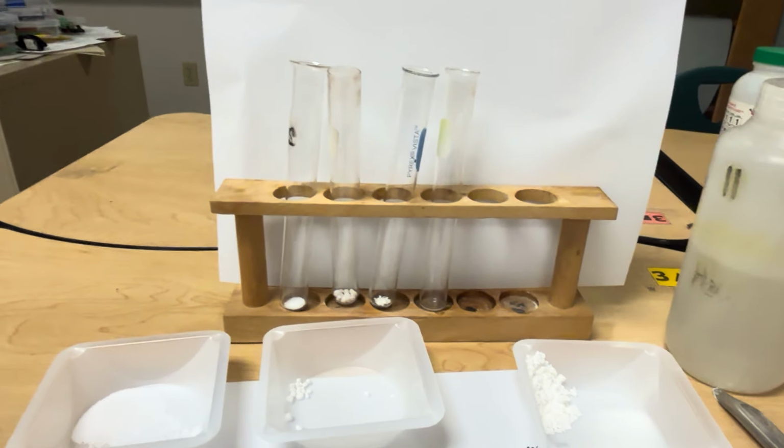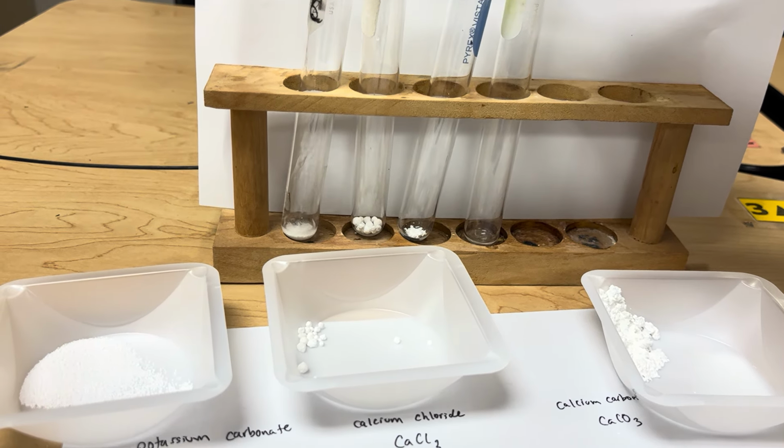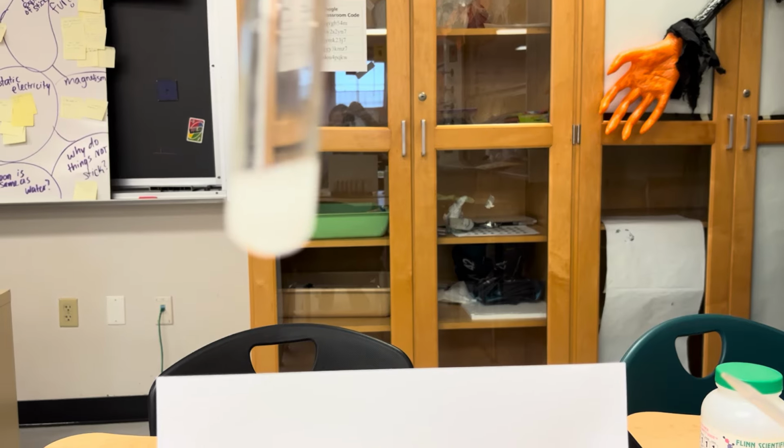And now we'll just do water in each one. There's water in my potassium carbonate. Just swirling that around.